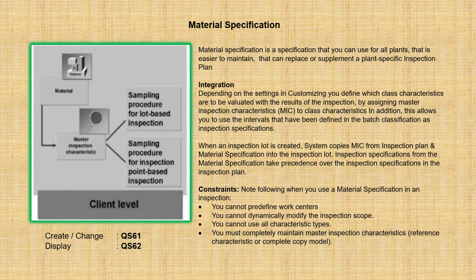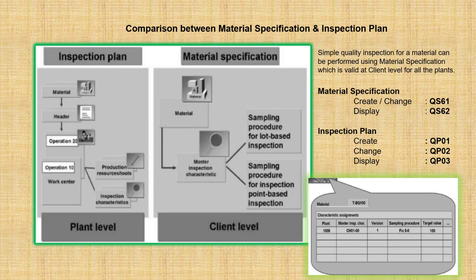In quality management, we can inspect the material based on the inspection plan or using the material specification. Material specification is another master data which can be used for inspecting the material field. Here also, we can assign different MICs to be tested and the sampling procedure to be used for the calculation of the sample size. It is much simpler compared to the inspection plan. A single material specification can be used for all the plants which are present.